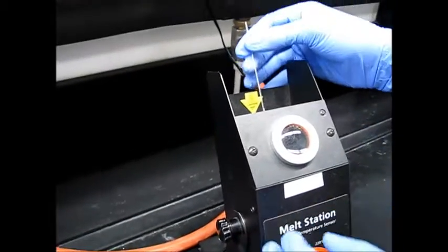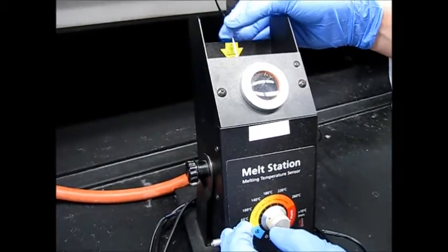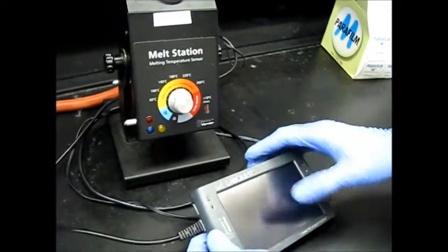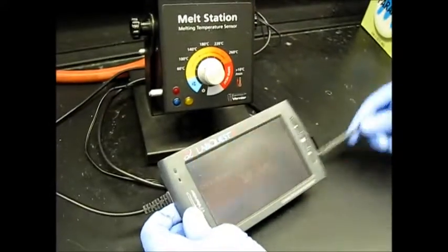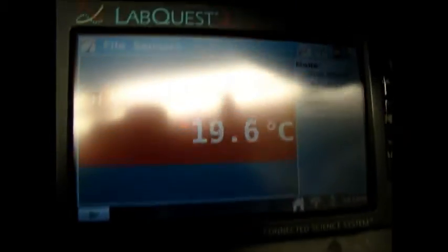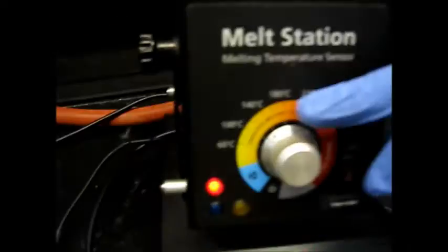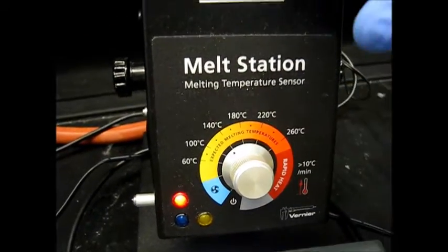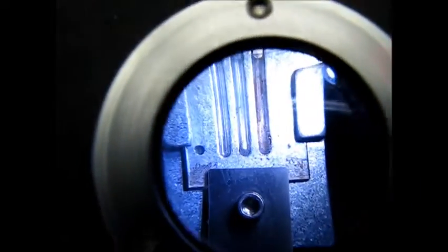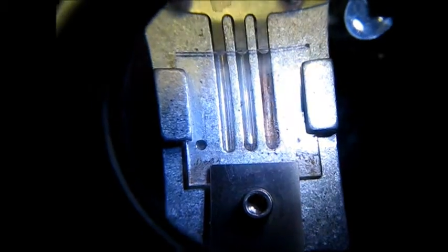So now that we got our sample ready, we're going to go ahead and put it into our melting point station. Make sure it's plugged in. We're going to attach it to our LabQuest right here. Make sure that it is reading the output correctly. We have this right at room temperature here. We can go ahead and turn it on so that it'll start warming up. We're going to be watching through this window. We're just going to monitor it until it liquefies, and then record the temperature that happens at.